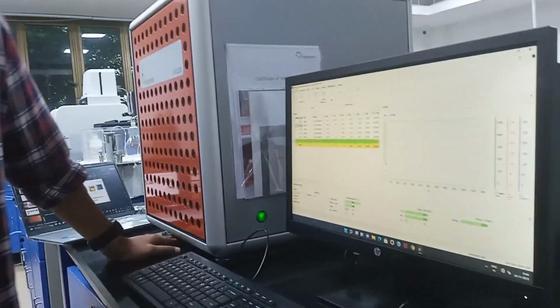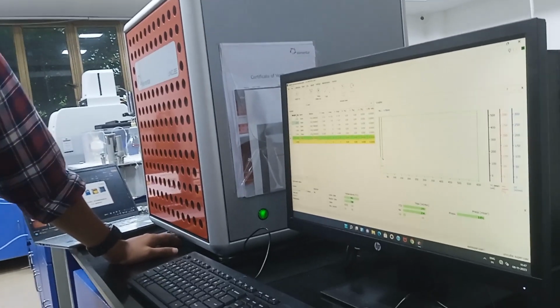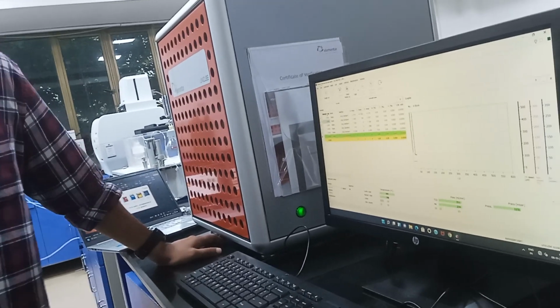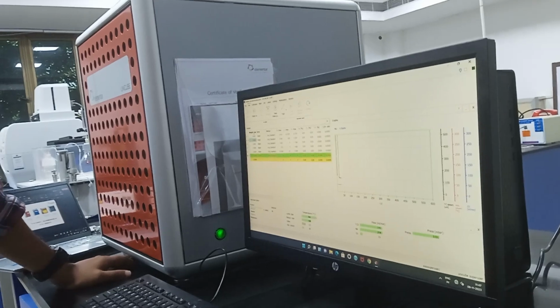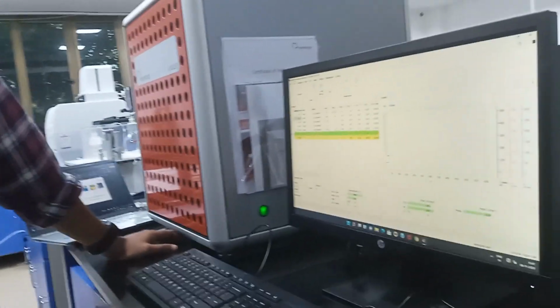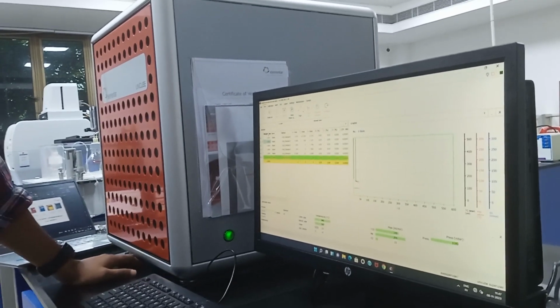No, that doesn't happen. For the blank, make it in a uniform manner. You can put 2, you can put 10. It depends upon your comfort. I'm saying, why do you want to put 2 for the blank? I'm asking that. What do you want to prove? Okay, so the basic thing we will follow is putting 1.